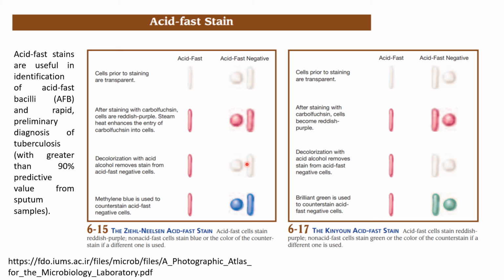Okay. And then we need to put a counterstain. This time our counterstain could be methylene blue or brilliant green. For Kinyoun, they can also use methylene blue.